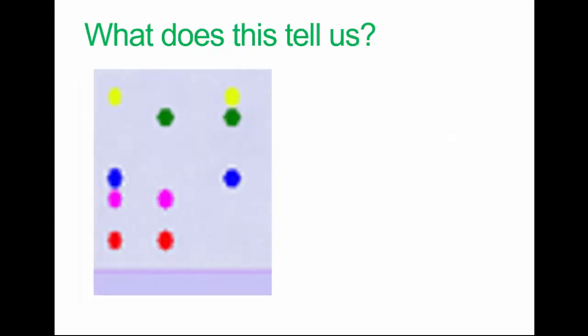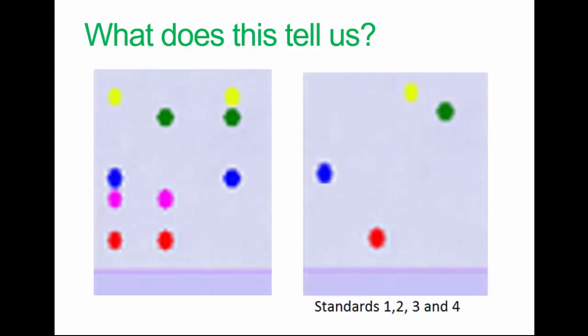So what does it tell us? It doesn't tell us a lot by itself. As normal in analysis, we need standards to compare our results with. As usual, we're mostly interested in analysing substances that we expect to find. However, chromatographic systems can be used as separation techniques, with further analysis being done by other methods, and more of this later. Okay, there's an example of some standards.